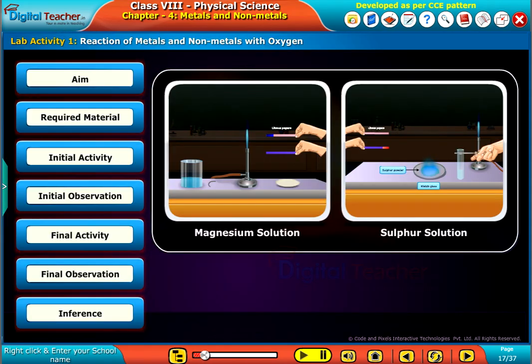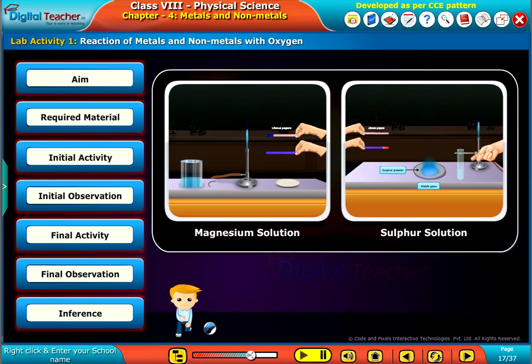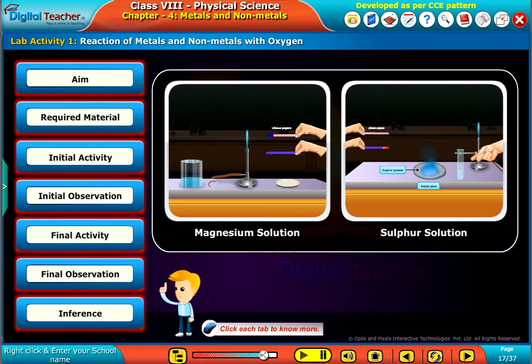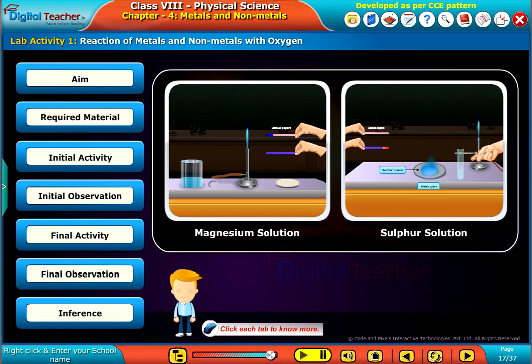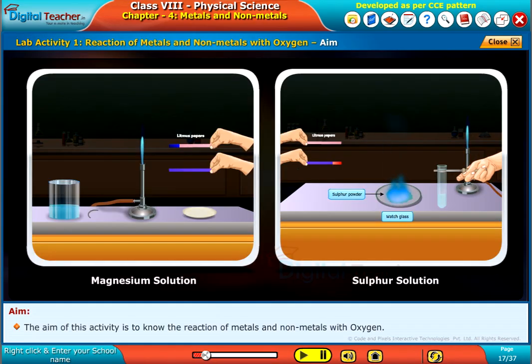Let us do a lab activity to know the reaction of metals and nonmetals with oxygen. The aim of this activity is to know the reaction of metals and nonmetals with oxygen.